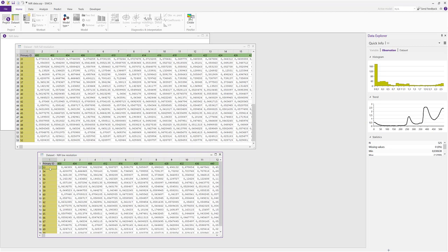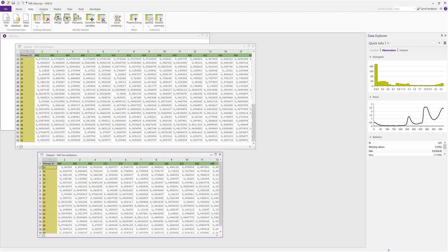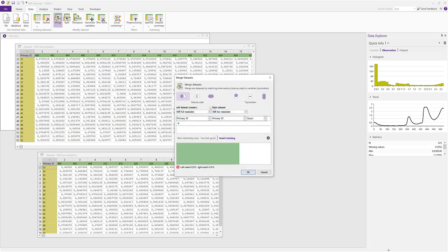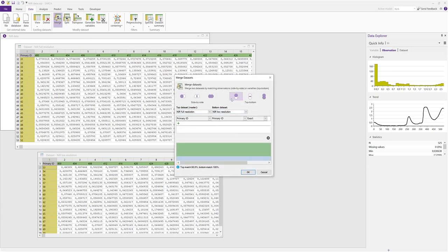We start the merging from the data tab, and now we select the first choice from the top bottom selection. This will keep all the variables from the top master data set and align the second data into it. We can see that the full resolution data set is already selected as the master data set.